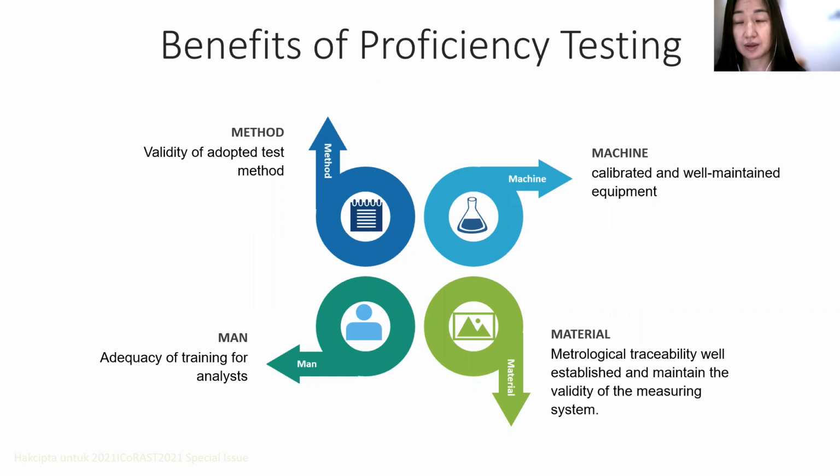This is the benefit of the PT. PT is beneficial for 4M here. We have the method, man refers to personnel, machine refers to equipment, and the material, such as certified reference material or reference material.